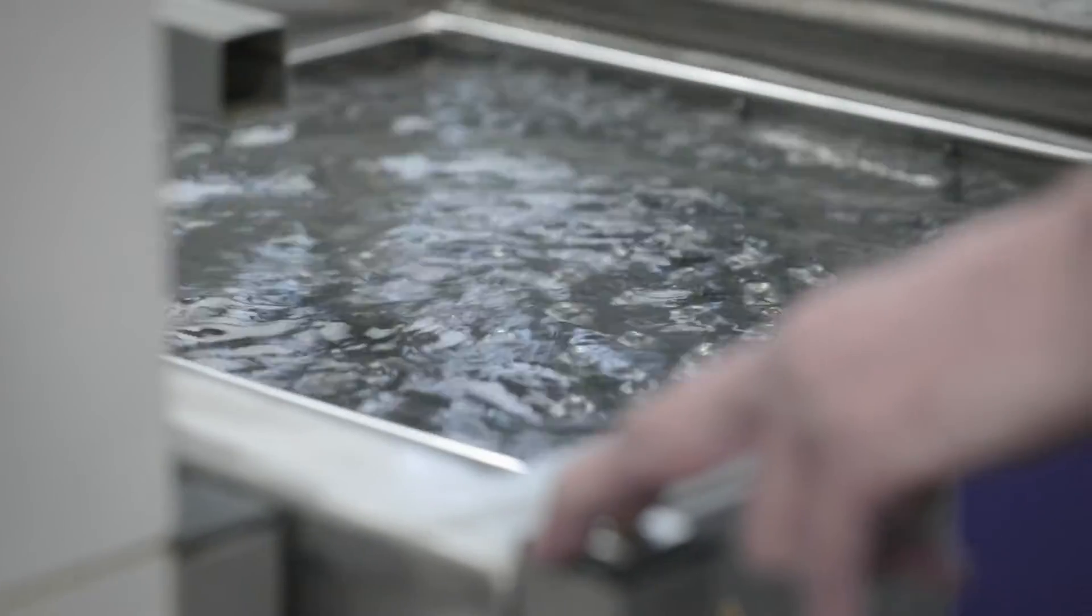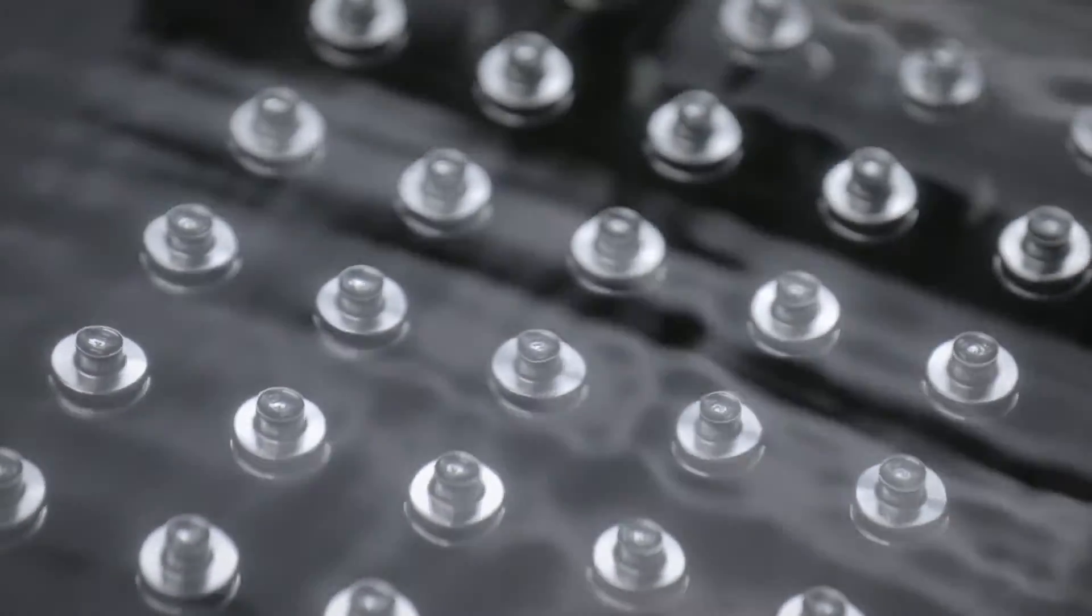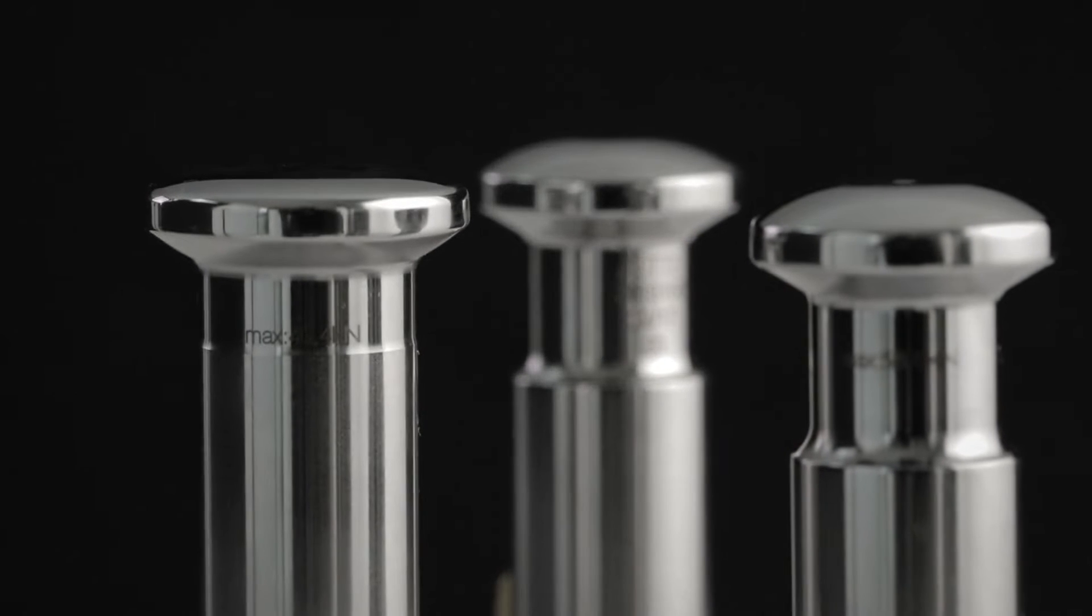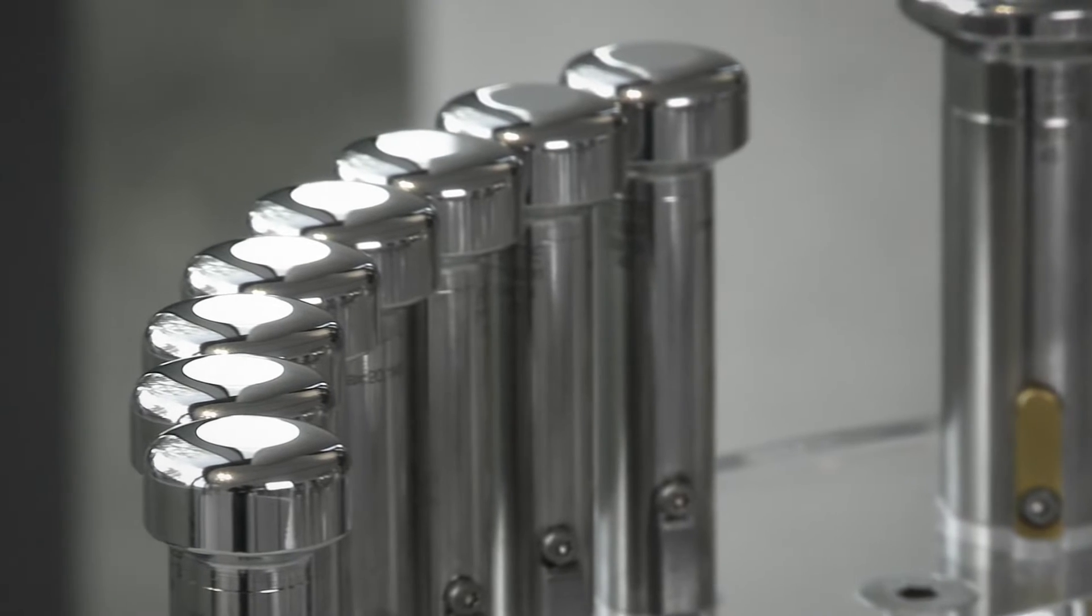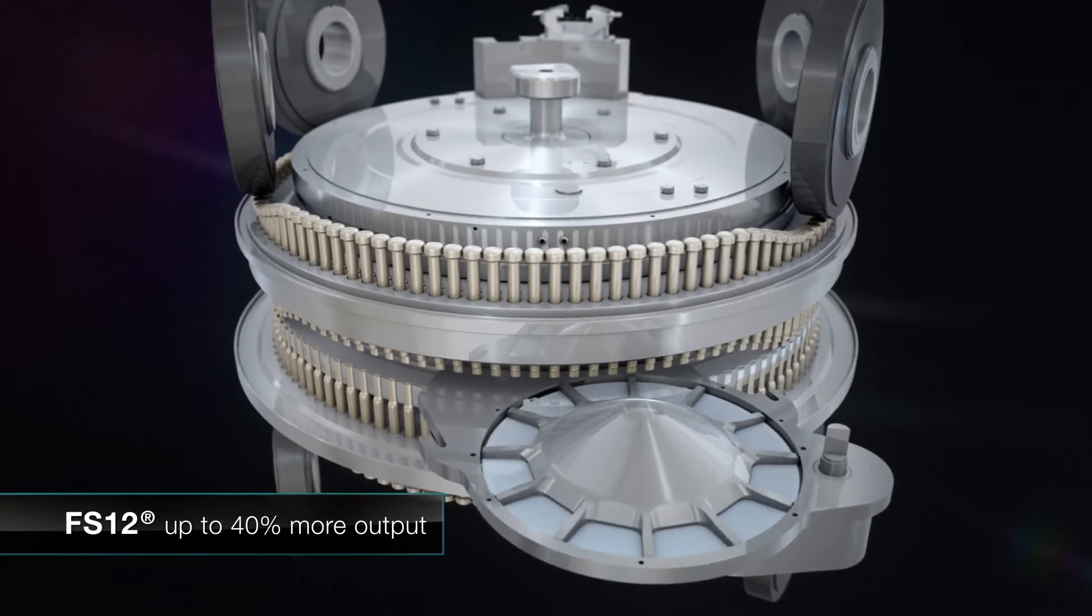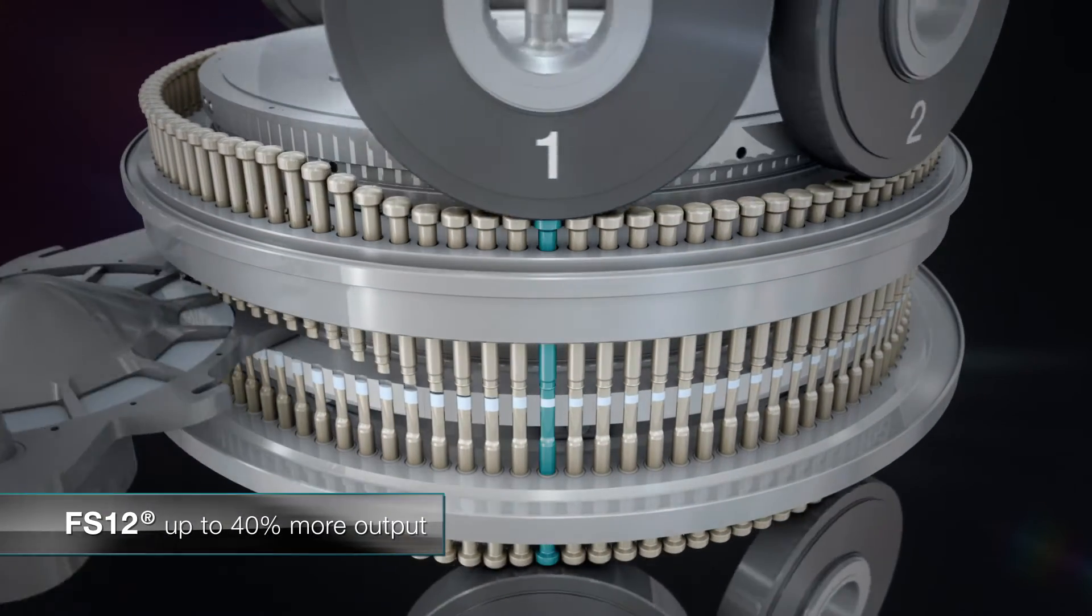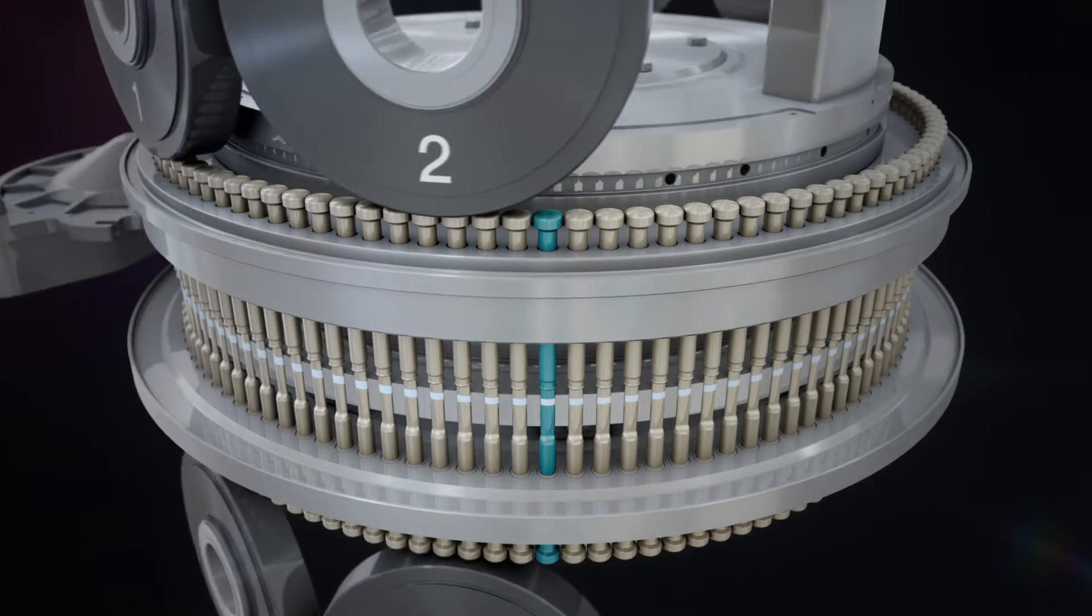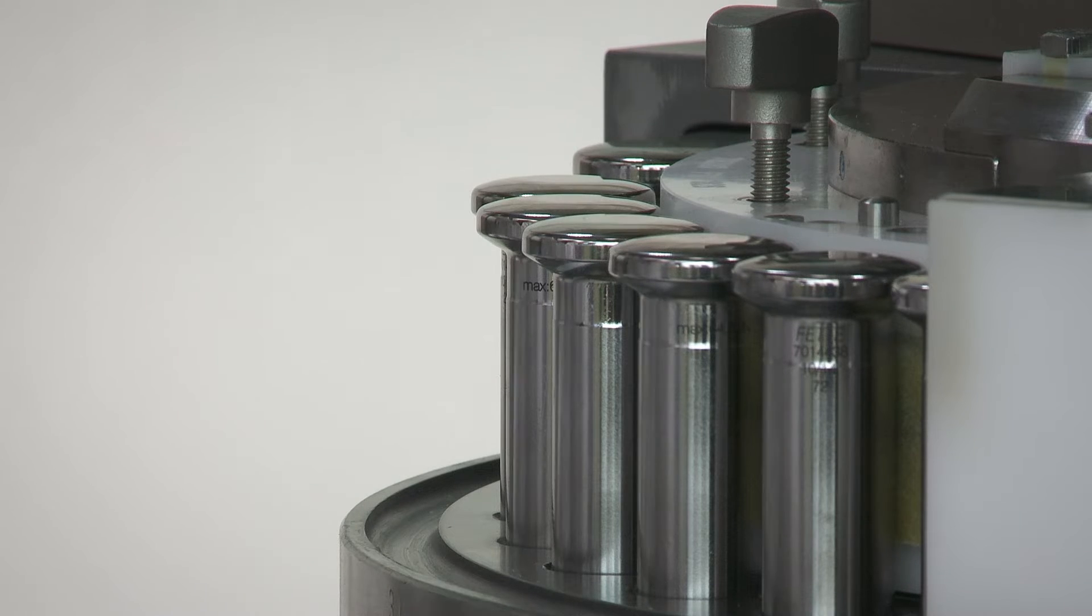For maximum output and flexibility, we offer specially developed punches in various sizes and geometries, such as the FS 12 punch which, in conjunction with our P max turret, can increase the output by 40 percent. Or the FS 19, which has a dwell time that is 30 percent longer.